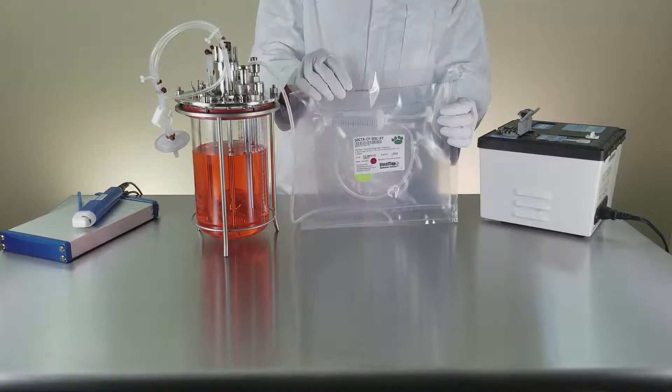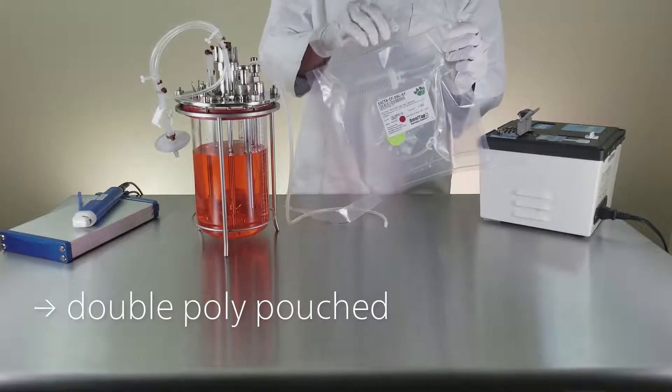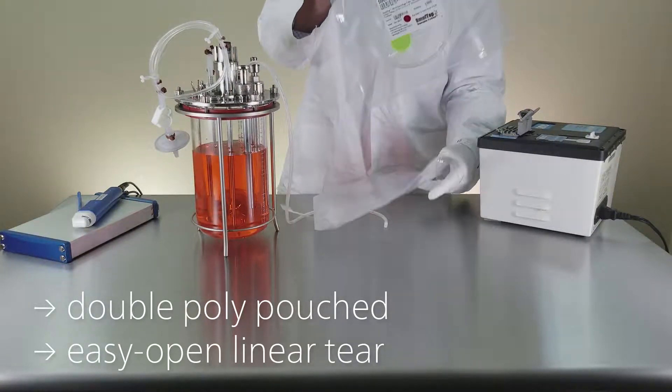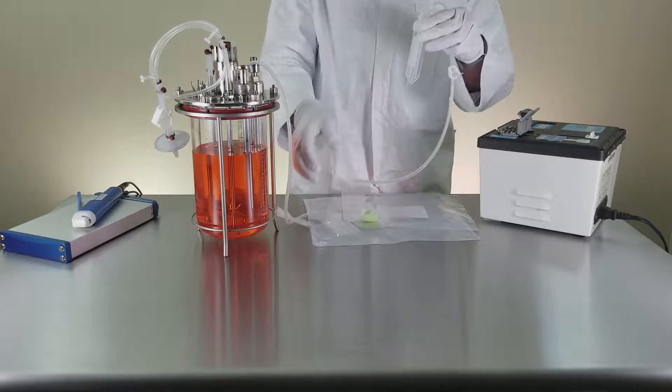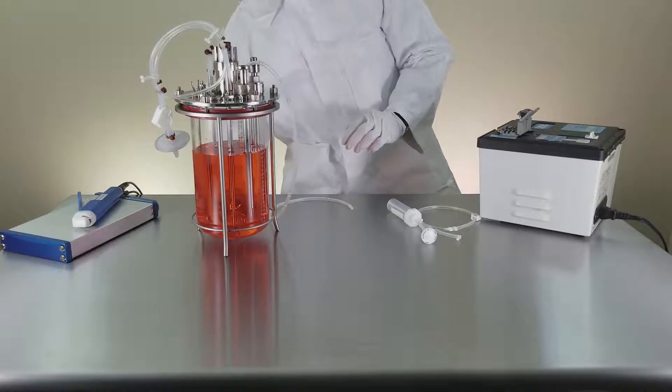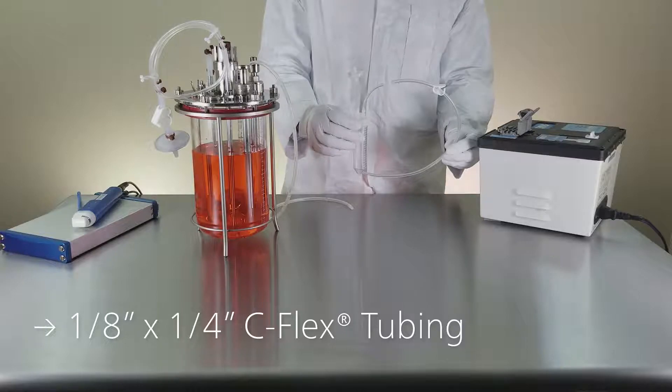As you open your Omnitop standard tubing assembly, you'll find that it is double poly pouched and features special linear tear pouches for easy opening. Here we use 1/8 inch by 1/4 inch C-flex tubing standard on all Omnitops.